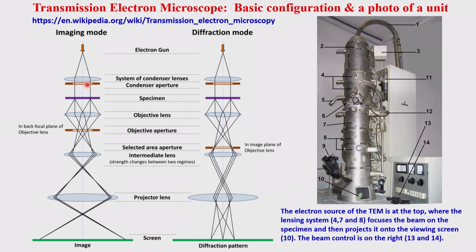So therefore you can do this with the TEM, even with scanning, so STEM, that kind of thing. That is where you can focus the beam. Whatever way you require, these apertures can be adjusted a lot. So a lot of adjustments are there in this TEM, not that simple.